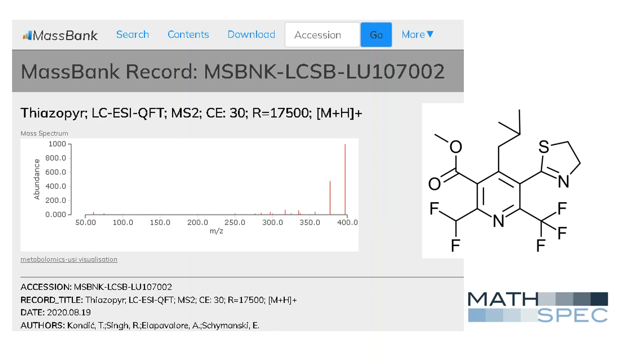The best spectra for identification work are spectra, like this one, that have multiple fragment ions and yet still have significant precursor ion intensity, because as the collision energy increases and the precursor ion disappears, the probability decreases that subformulas found with our Excel add-in will match substructures in an unknown analyte.